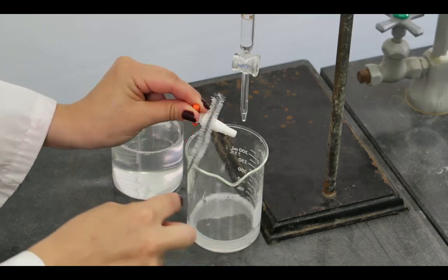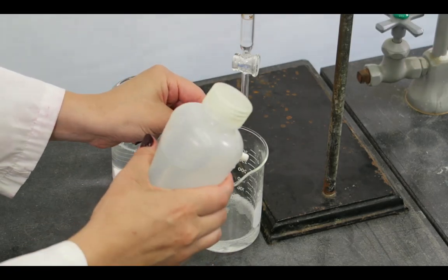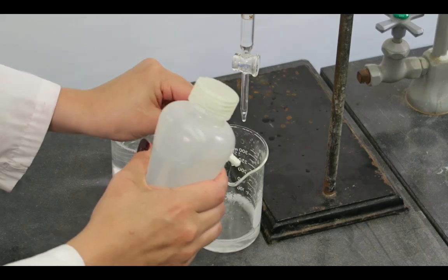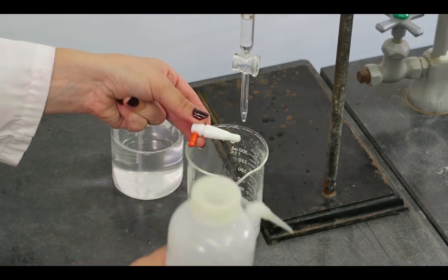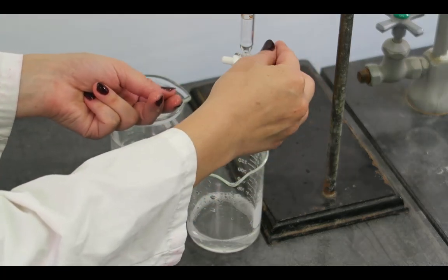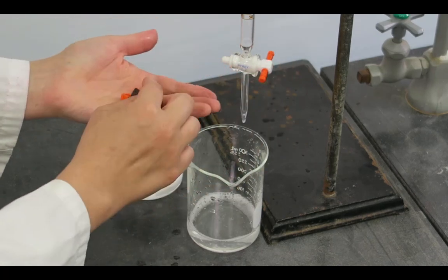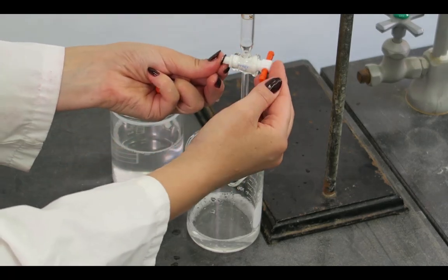Gently scrub the stopcock with warm soapy water and a brush. Rinse with deionized water, then replace the stopcock in the burette, followed by the teflon washer, rubber washer, and then the teflon nut.